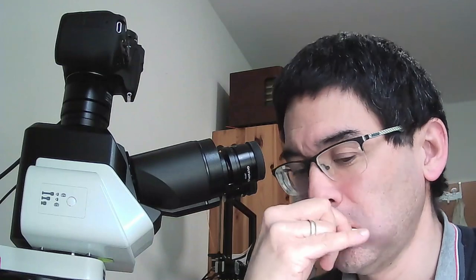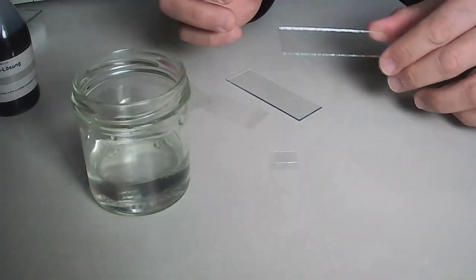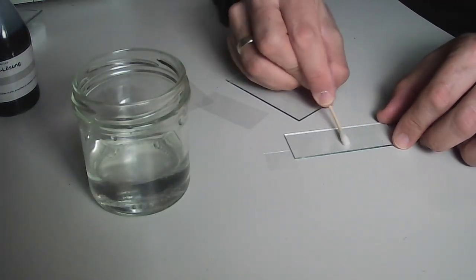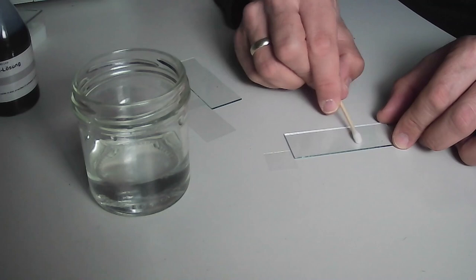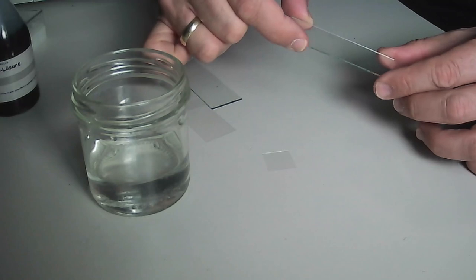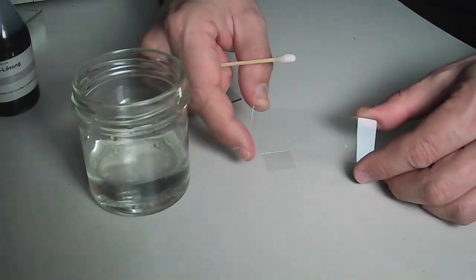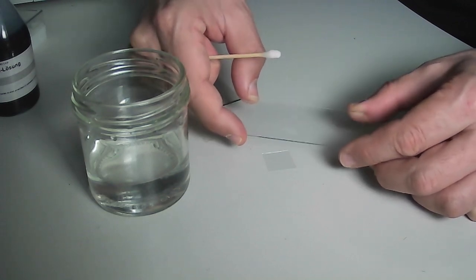Okay. So, okay, rotate the whole thing. And there should be now plenty of cells on here. And oh, I need to change the position again here. Okay. So what I'll be doing is I will simply spread the cells on the slide here, and by rubbing it back and forth, you're also breaking up cell clusters. And of course, you can see that there is something on here already. You might not be able to see it. Maybe in the reflection of the light, there is clearly some stuff on here already.